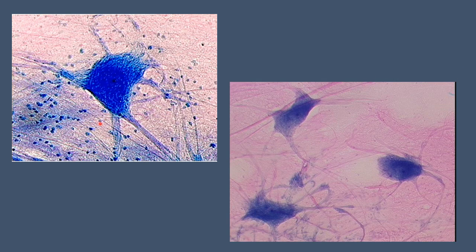And so these are a couple of pictures here. These smaller structures here are showing the glial cells. This is the cell body here of a neuron. And once again, these are the neurons here, the cell bodies, these larger structures. And as you can see, they do have these extensions from them. That's what's helping to allow the electrical impulse to move from one area to another along those appendages or extensions.